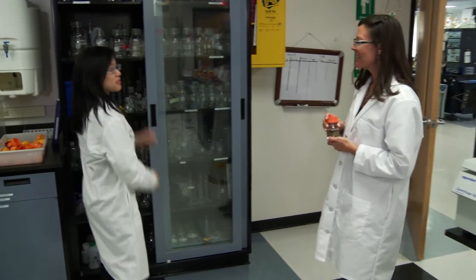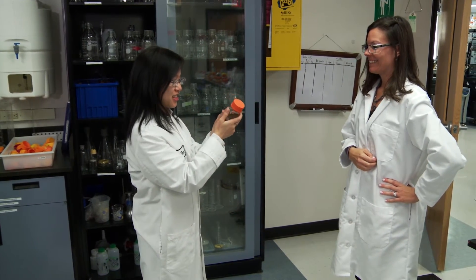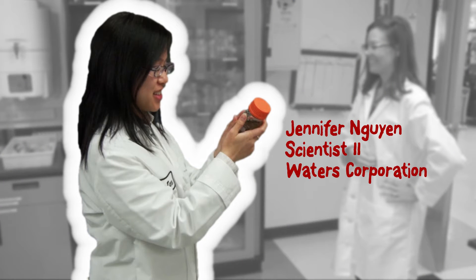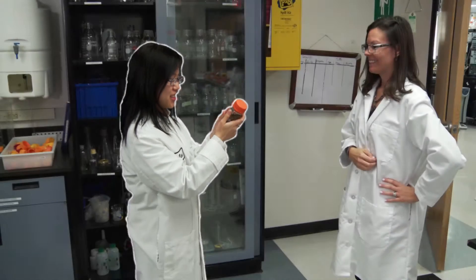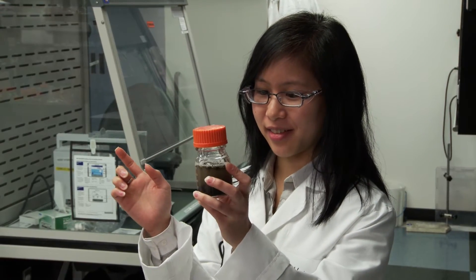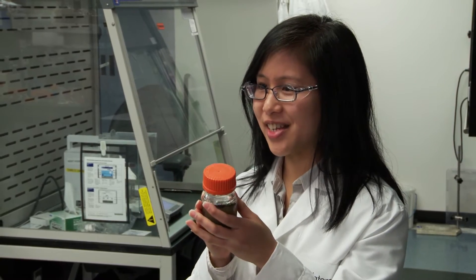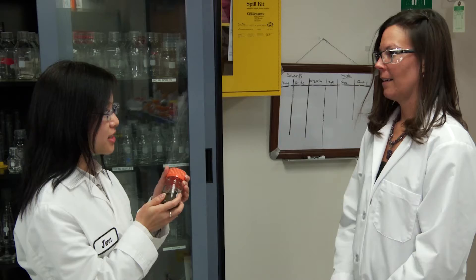Hi Jen, you're just the person I was looking for. I have a big challenge for you — more dirty samples. The MS lab has banned me from using their instruments. They say my samples are too dirty and it takes too long to clean their instruments. What are we going to do?